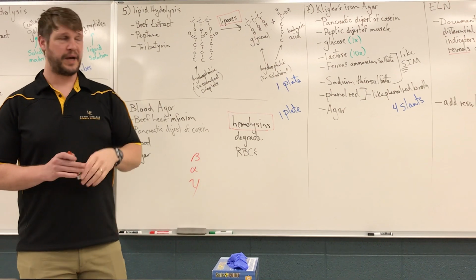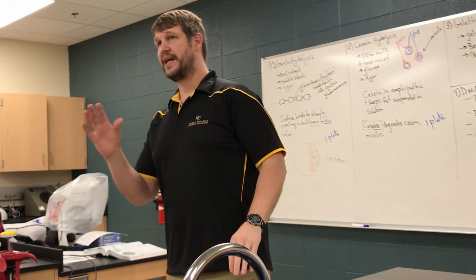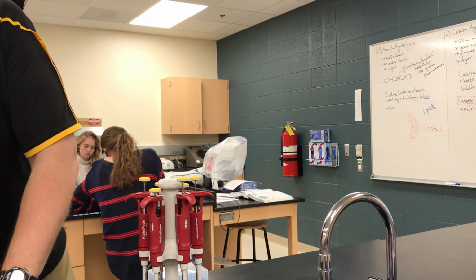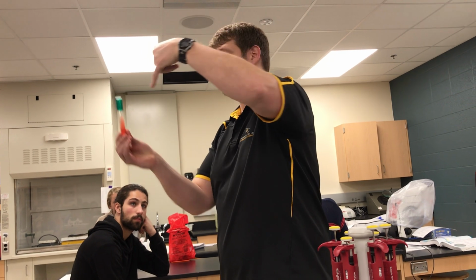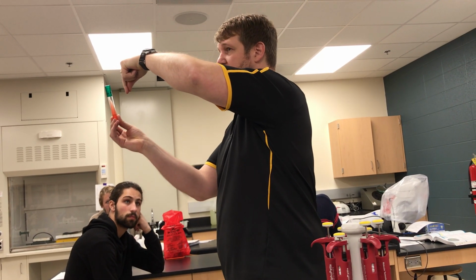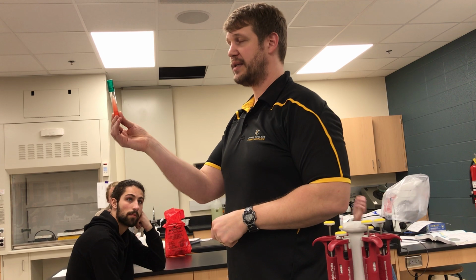Okay. Now, there's something else really cool about this. It also tells us something about oxidation versus fermentation of those products as well. Because the way you inoculate this media is you're actually going to stab down into the base, and then when you pull the needle out, on the slant part, you're going to streak a fishtail up just like you would if it were a normal slant.